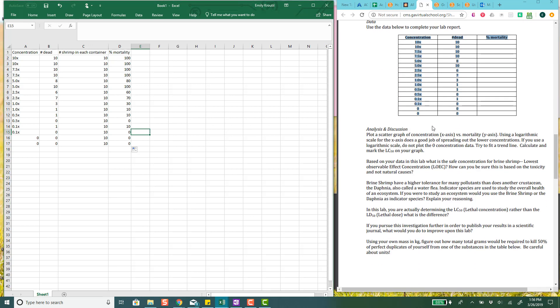And I can do that and then scroll all the way down and it gives me my percent mortality for all of these. Okay. So, I don't have to actually do any math which is kind of handy because I don't like doing math. So now we want to make a scatter graph of concentration versus mortality. Okay. So let's see what we can do. Let's try this.